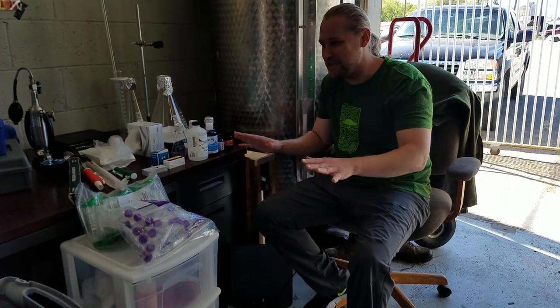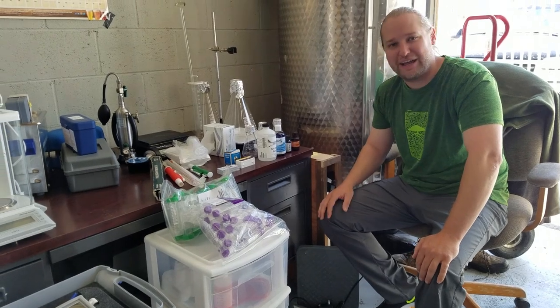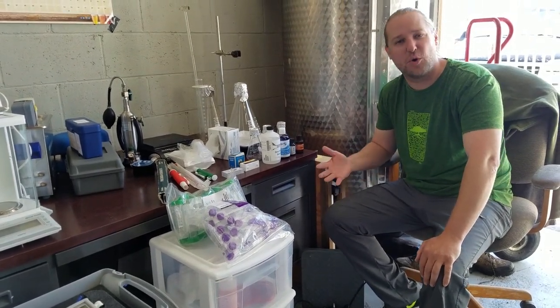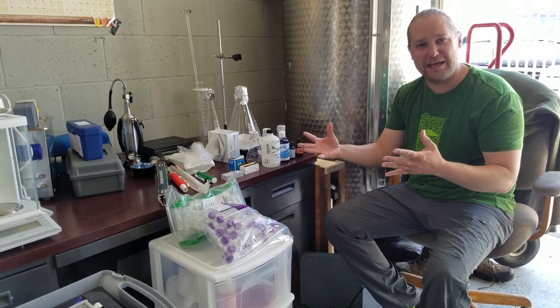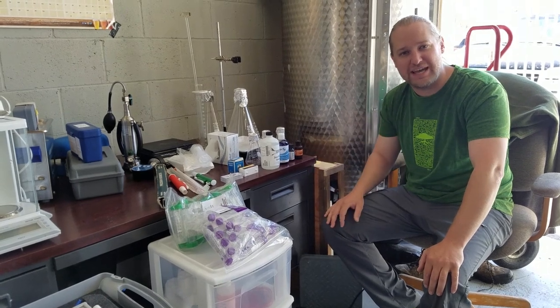I've laid everything out here on my desk — usually everything's put away and I bring it out as I need it, but I got most of the stuff out here today. Some things I'm still working on and expanding: trying to get going with an incubator, a shaker, and an autoclave so I can start pouring my own plates and doing some streaking tests.